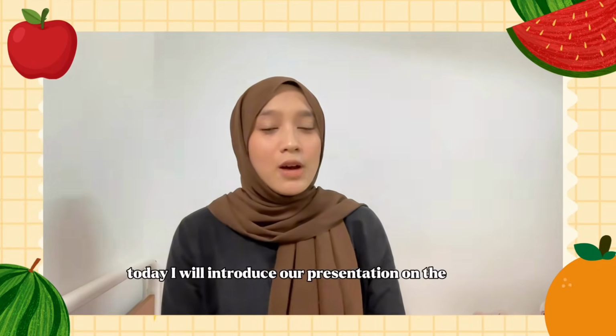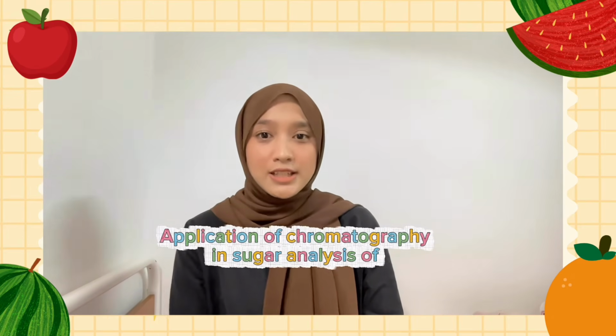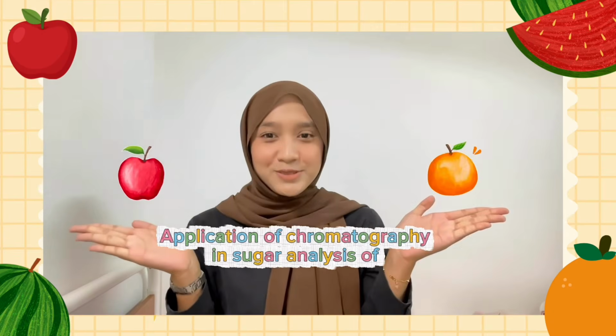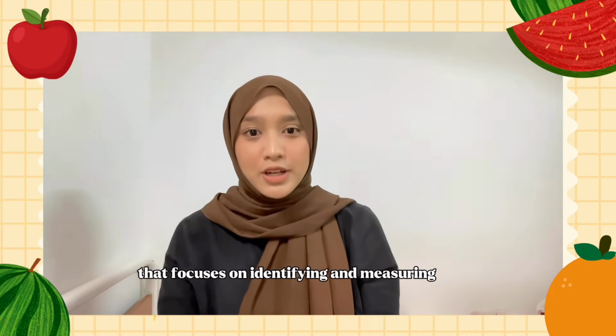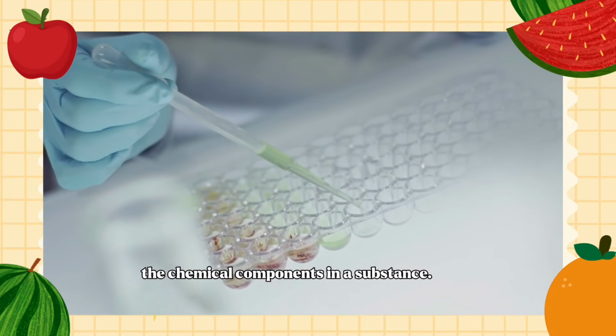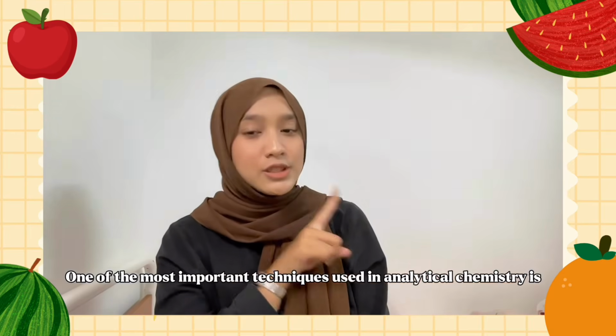Hello everyone, I am Nur Atira, and today I will introduce our presentation on the application of chromatography in sugar analysis of apple and orange juice. Analytical chemistry is the branch of chemistry that focuses on identifying and measuring the chemical components in a substance. One of the most important techniques used in analytical chemistry is chromatography.